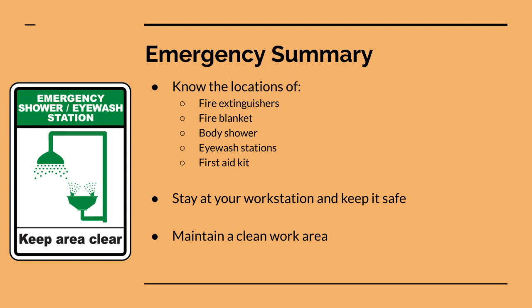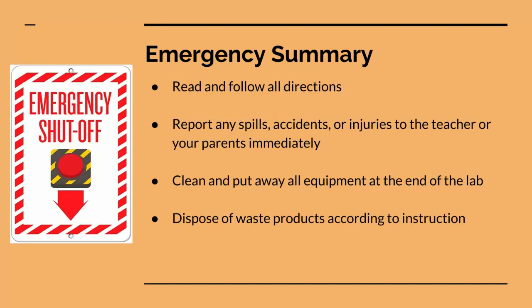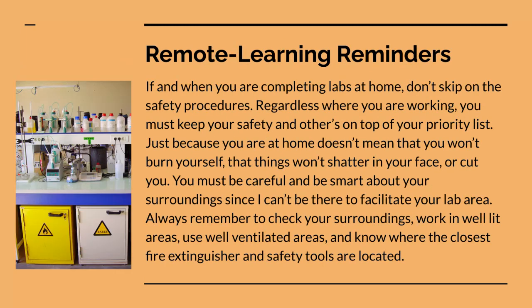And then pretty much stay at your workstation, keep it safe. And finally, maintain a clean work area. That includes, remember, don't keep your binder, your papers, your backpack, and all the other stuff on your table while you're doing an activity. Follow all directions, report any spills, accidents, or injuries, clean up and put away all equipment at the end of the lab, and dispose of waste products according to the instructions.